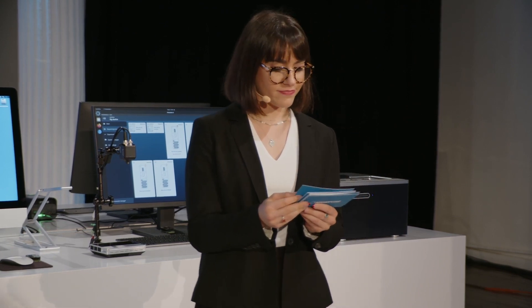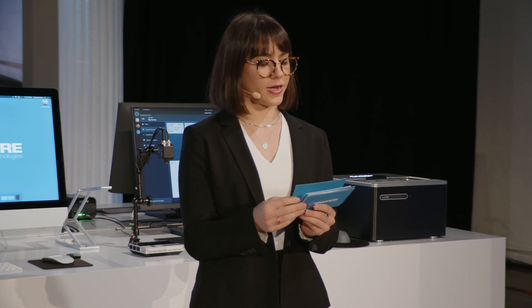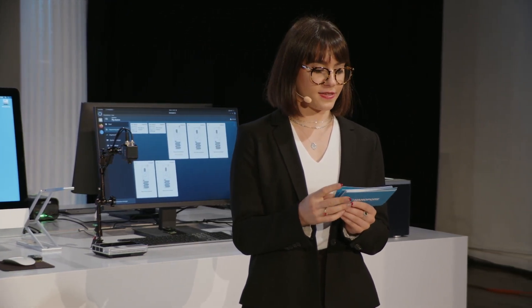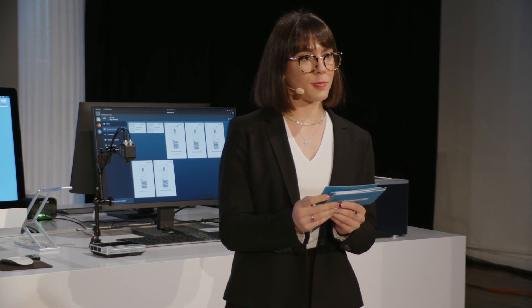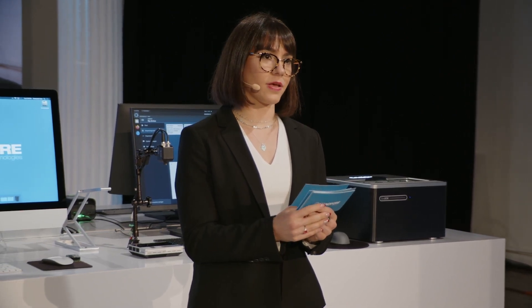Some of you may be thinking: what if I don't have a PromethION 24 or 48? I'm happy to dissuade that fear because everyone can now join in on the PromethION fun. With the range of our PromethION devices — from the PromethION 2, PromethION 2 Solo, or the PromethION 24 or 48 — the power of PromethION sequencing is now available in many configurations that will work for you.